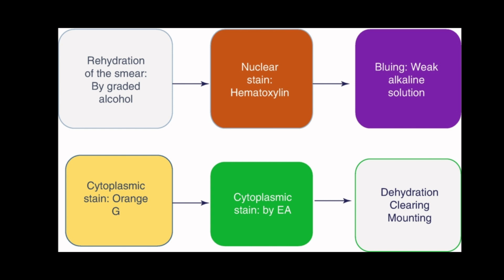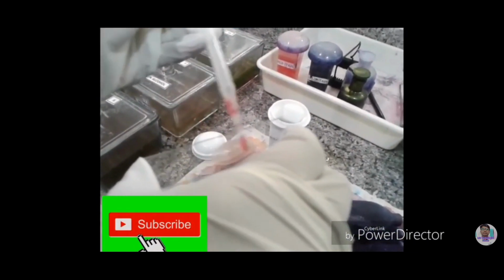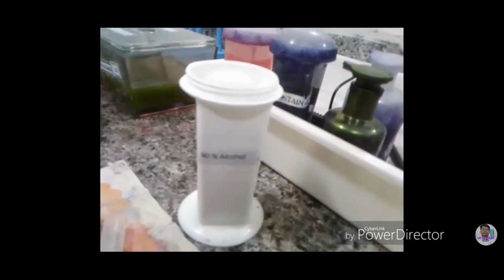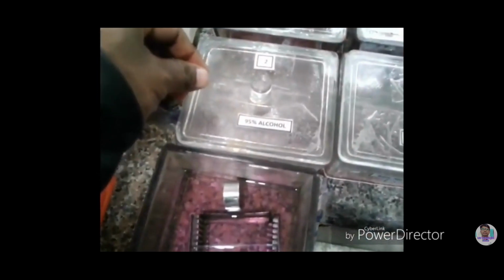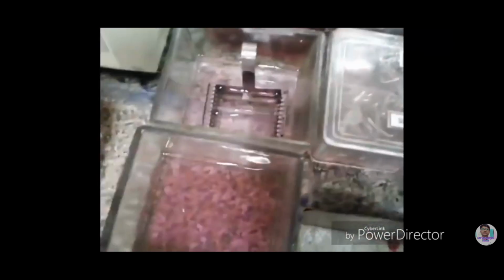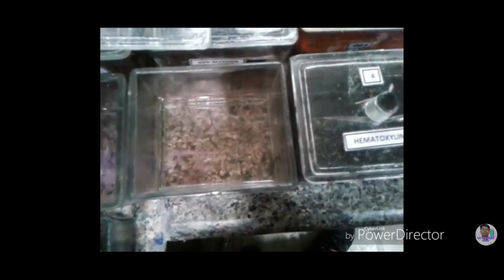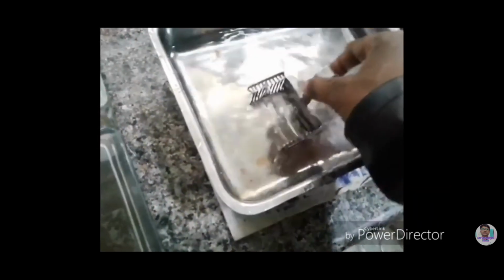For the procedure for the Papanicolaou smear, first the smear is placed in a fixative immediately while still wet to prevent drying artifacts. The smear must be kept in fixative for at least 1 hour, and then after an hour, hydrate in 95% alcohol for 2 minutes, then 70% alcohol for 2 minutes. After rehydration, you can rinse it with tap water for 1 minute. After rinsing in tap water, you now stain the nucleus with Harris hematoxylin for 5 minutes. So you immerse your slide into Harris hematoxylin.